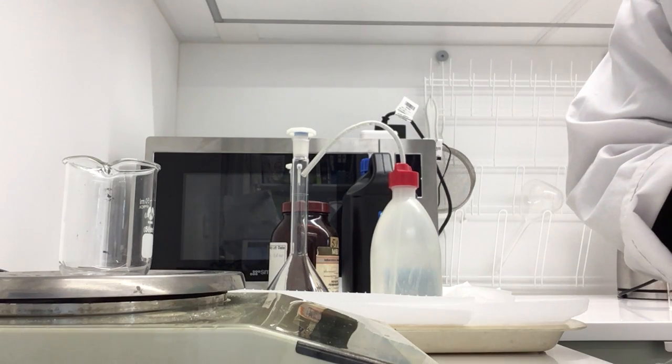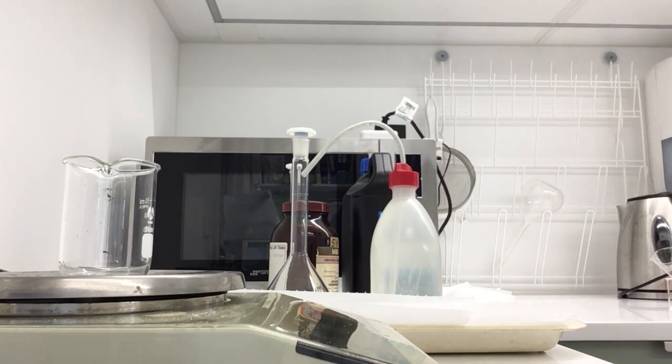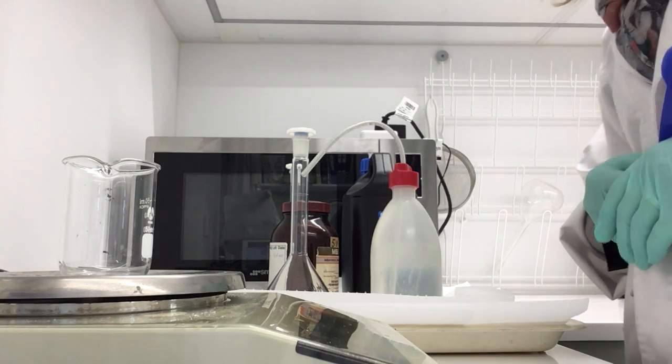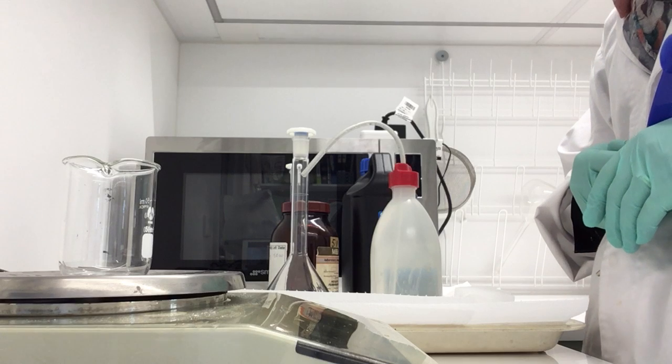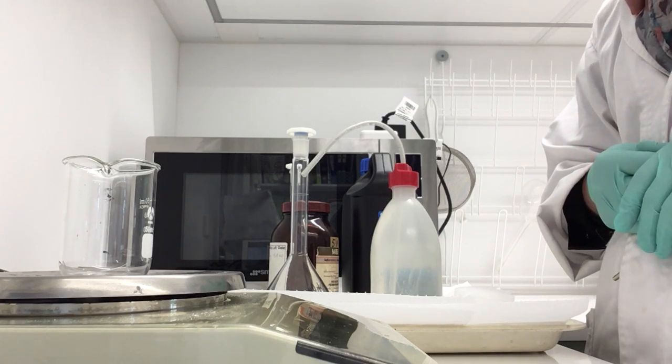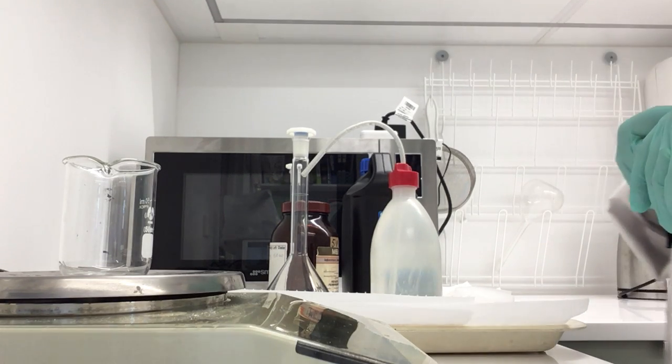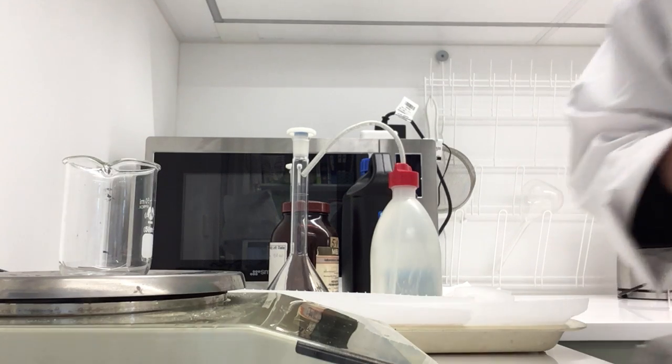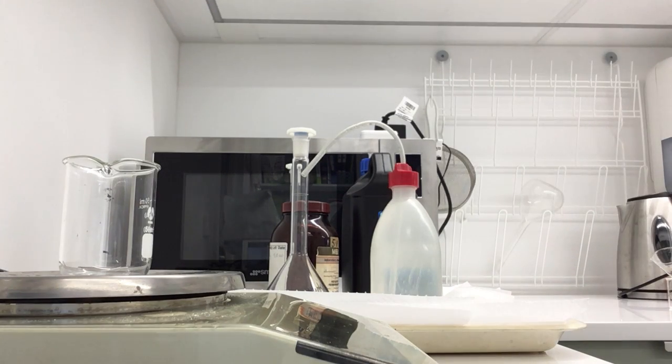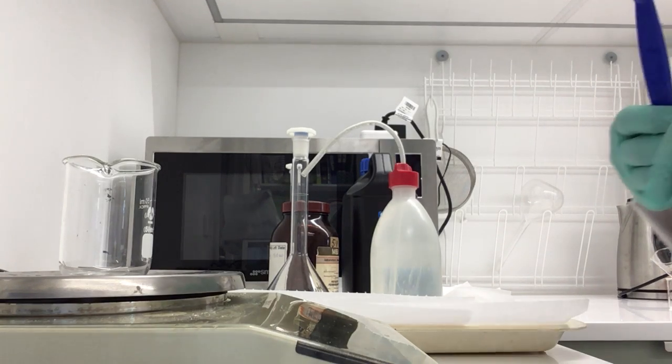We're doing hydrogen peroxide and bleach today. The first part of that is to make up our standard potassium permanganate solution, our KMnO4, and we're aiming for a concentration of 0.02 molar, which I've worked out in 250 mL is about 0.79 grams.